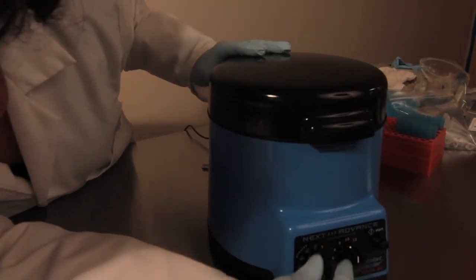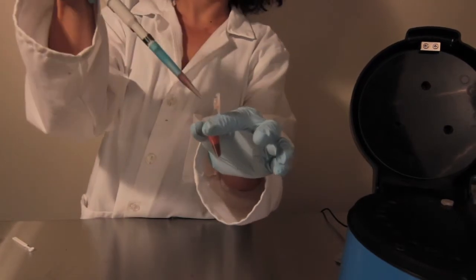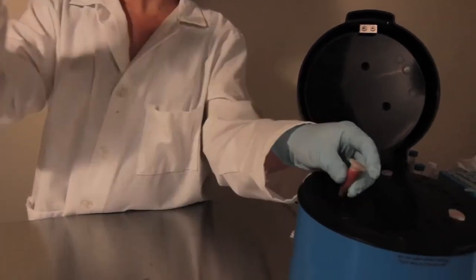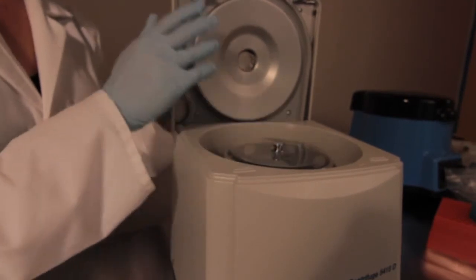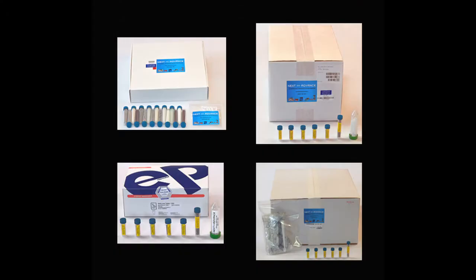Immediately after your sample is homogenized, add the remaining volume of TRIzol required by the protocol and vortex by running in the bullet blender at speed 2 for 1 minute. When the extraction is complete, you can spin down the tubes. There is no need to remove the beads since the RNA will be in the supernatant. Of course, if you're extracting RNA, make sure to use RNase-free materials to handle your samples.